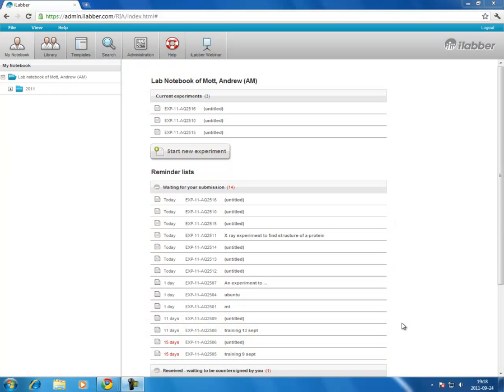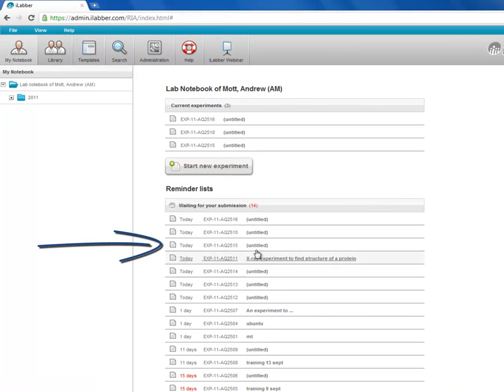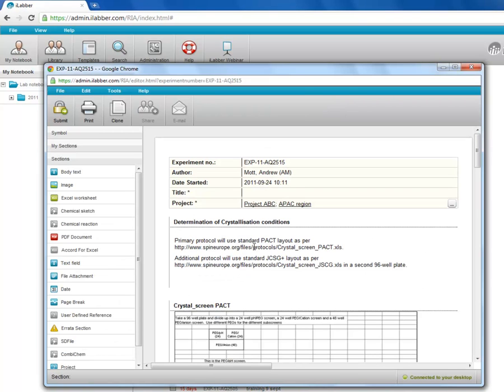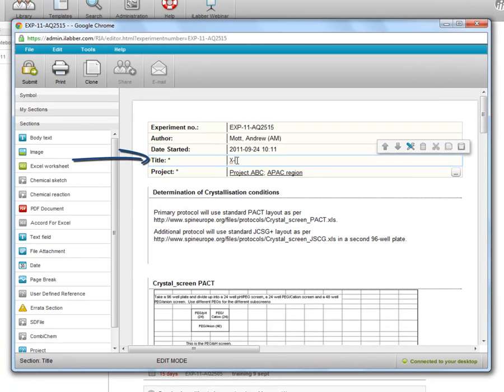This video describes the signing and witnessing process in iLabber. So, we have an experiment and we finished working on it. Remember, the experiment must have a title and it must belong to one or more projects.